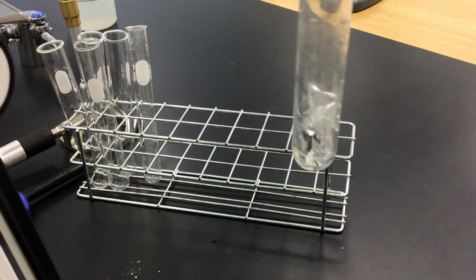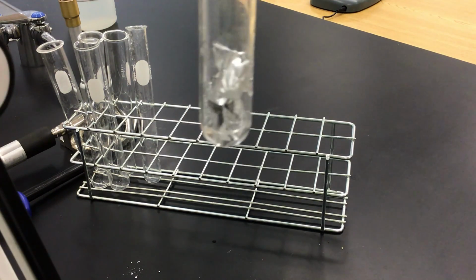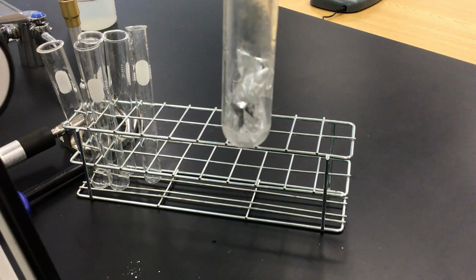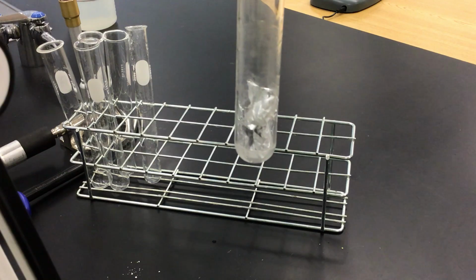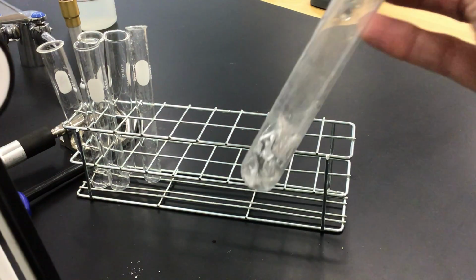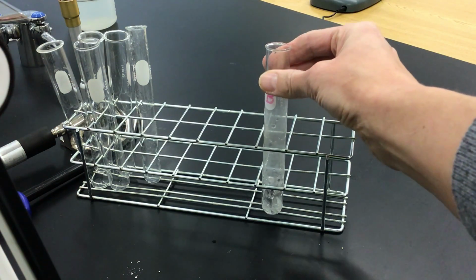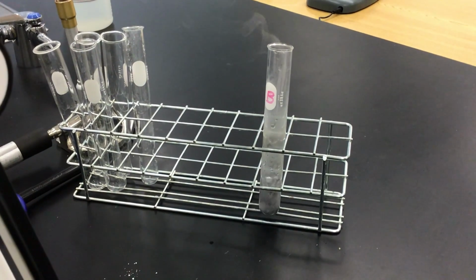You can kind of hear it starting. You hear the little bubbles. You can see it, the little bubbles starting to form. Once that reaction gets going, there we go. All right, I'm going to put it back in here, because as it starts to get going, it does get really, really hot. You can see the gas coming out, so we've got bubbles.